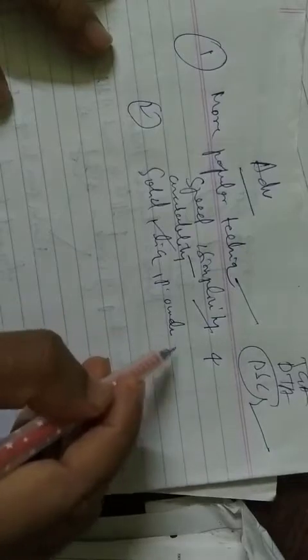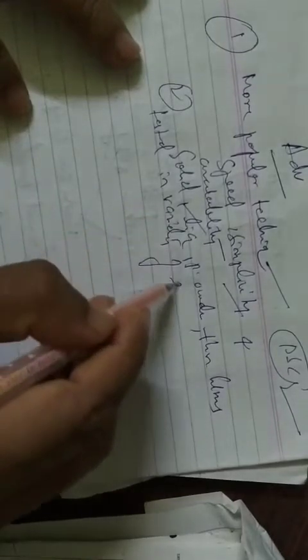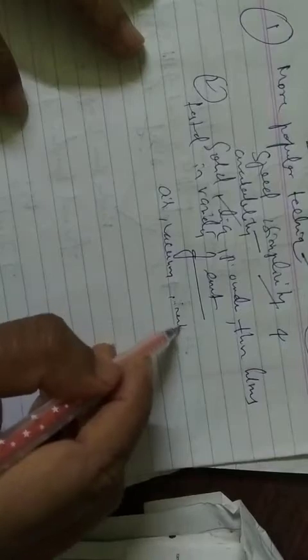The second is that different kinds of samples, such as solid, liquid, powder or thin films, can be tested in a variety of environments, like air, vacuum, or inert gas, etc. So this also becomes a very important advantage.